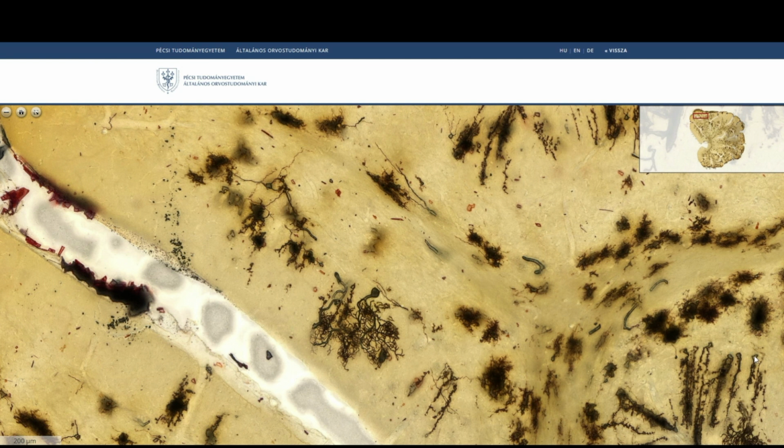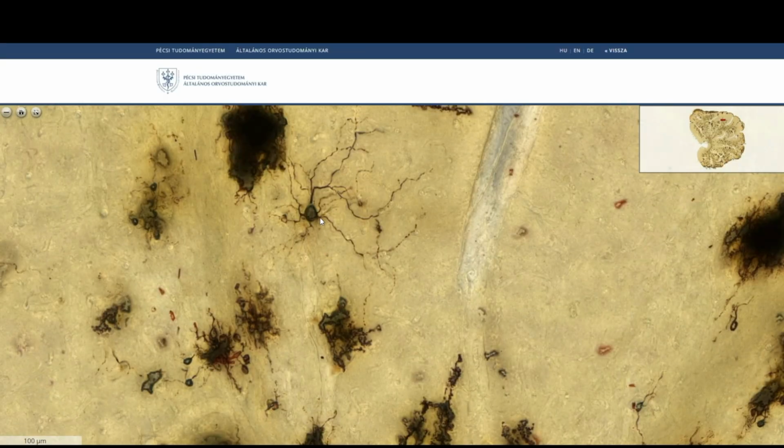And otherwise you see on the right side of this photo Bergman glia cells upside down, extending through the whole molecular layer, and otherwise you see again the quite messy cells, partly in the gray matter. Then these are protoplasmic astrocytes, partly in the white matter. These are fibrous astrocytes. In this part of the photo, we see a quite huge and irregular cell body with the processes. This is a Golgi cell.